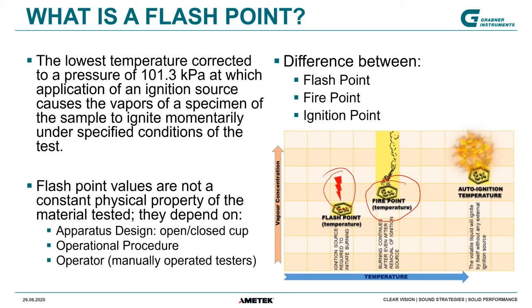And this is again much lower than what we call the auto-ignition point. Auto-ignition temperature is when a sample is so hot that it starts burning automatically. What we are measuring with our flashpoint tester is basically the flashpoint temperature.